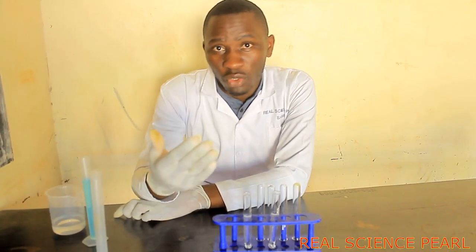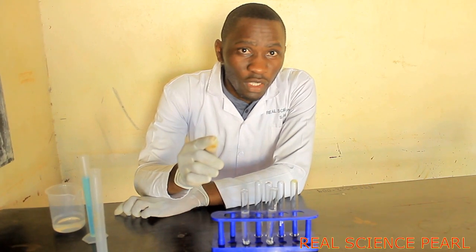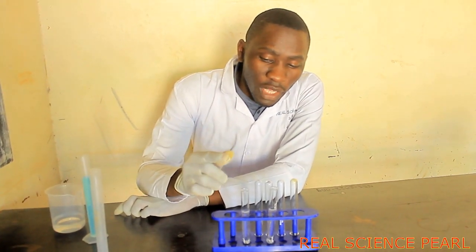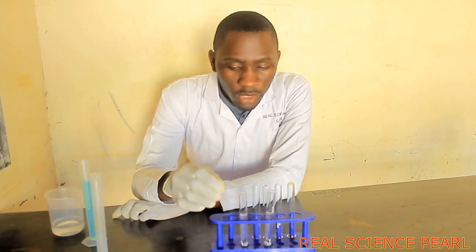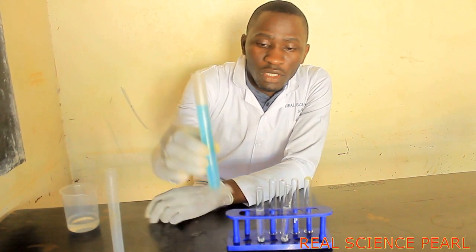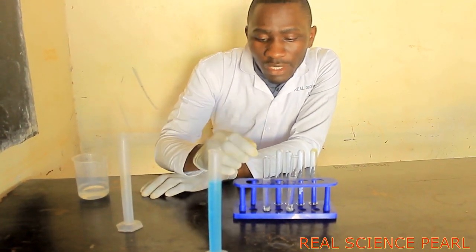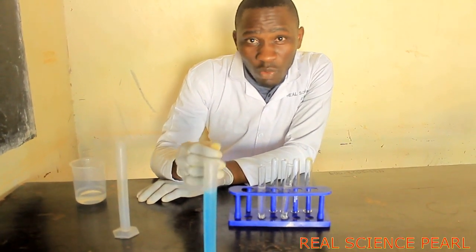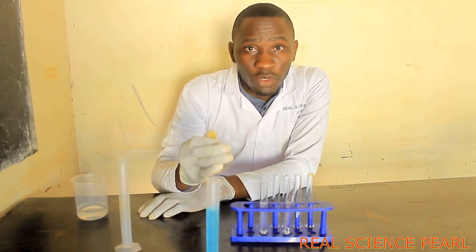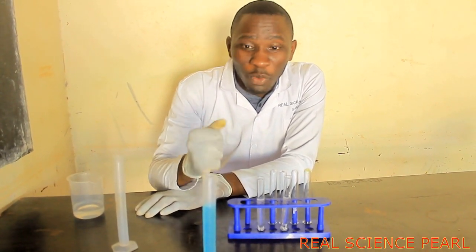catalyst. Now, a catalyst can be a solid, it can be a solution, but remember, catalysts are always specific, meaning a catalyst will catalyze reaction A, it cannot catalyze reaction B. Now here, the catalyst for this reaction is dilute copper sulfate solution. And when I add a few drops, because we know catalysts work in small or minute quantities, it may alter the rate of this chemical reaction.